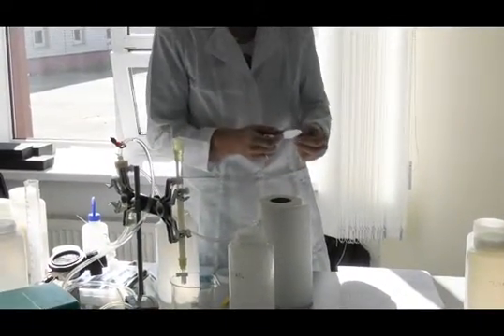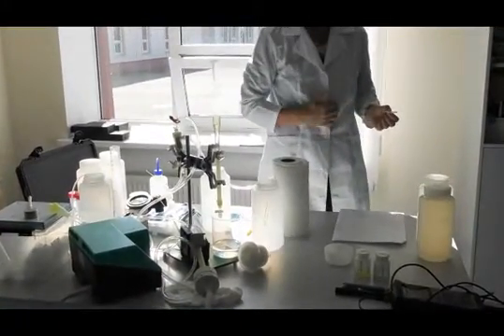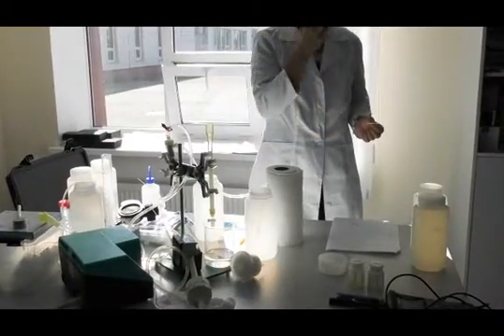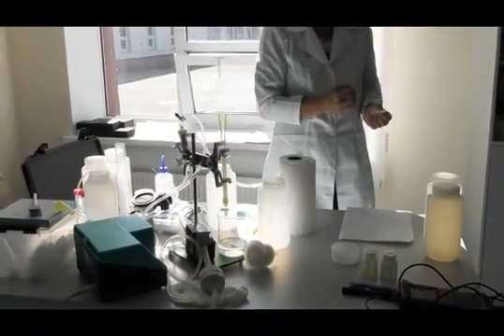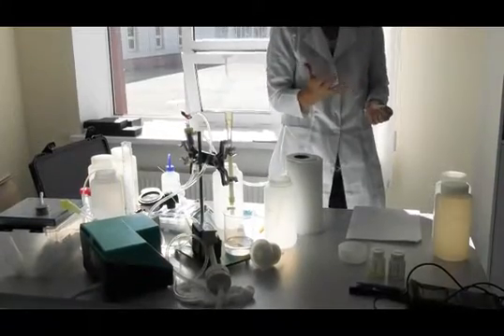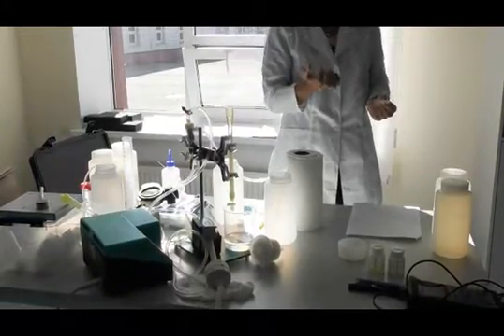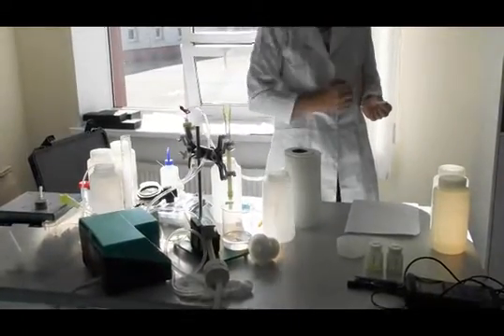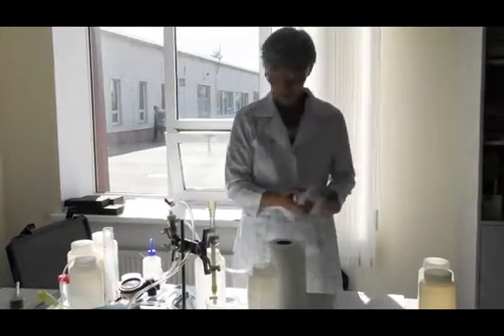I have a membrane filter here that is much used. It can be put into a housing like this, but it's the same problem here. It's a small area, just a few square centimeters, and you need to force the sample through somehow, and then it's easy to clog the pores, and then you don't necessarily have the 0.45 micrometer cutoff anymore. Or if you put even more effort to get the sample through, you can destroy the filter, and then you destroy your sample. You have to start again.